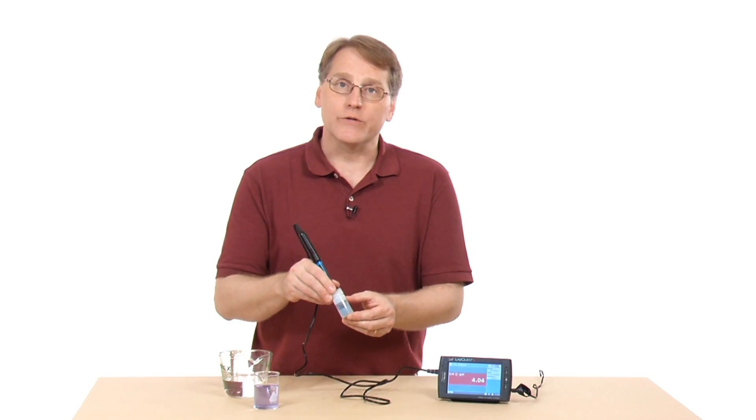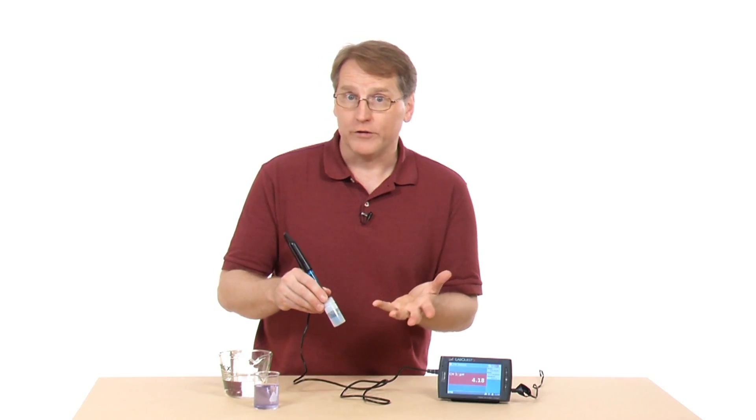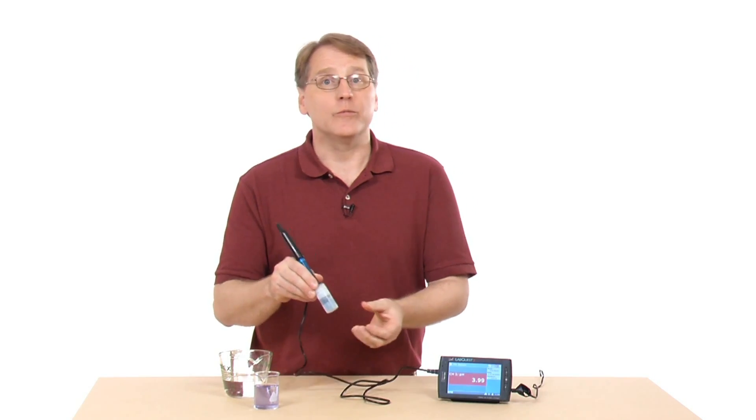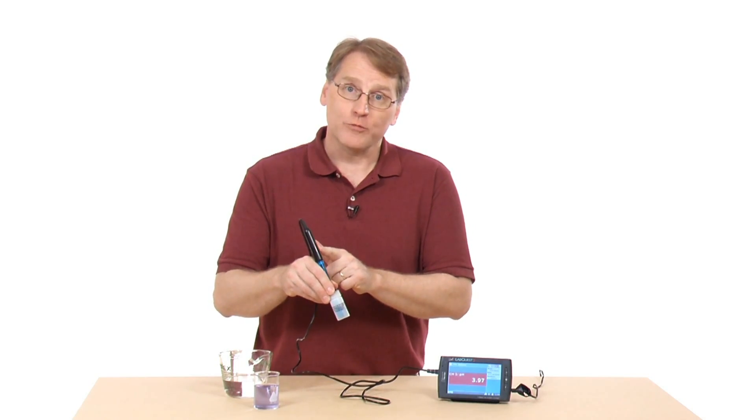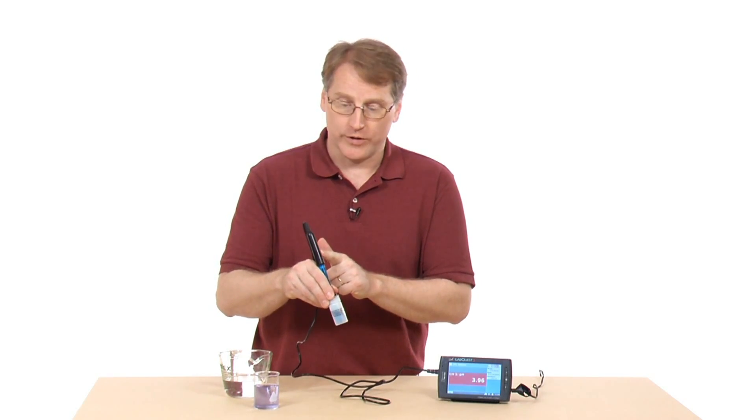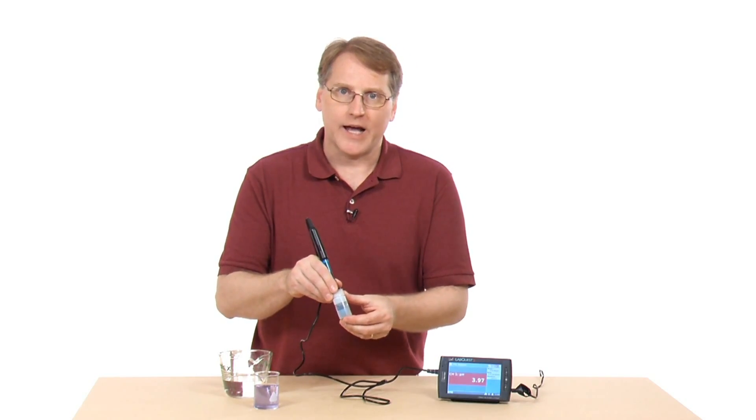To do this, you put it into known conditions. You might put it into a pH 4 buffer solution and tell it that's what it is, then move it into say a 10 and tell it that's what it is. Then you can actually store that to the sensor. This is a smart sensor that has built-in storage capacity, so you can save that calibration.